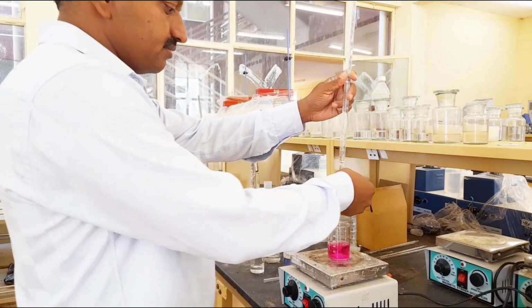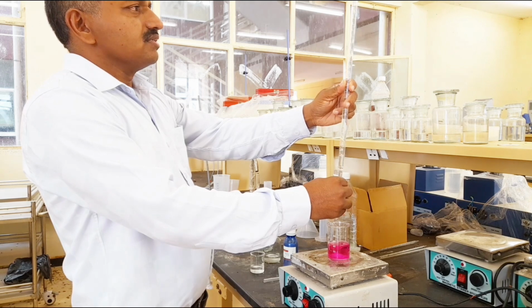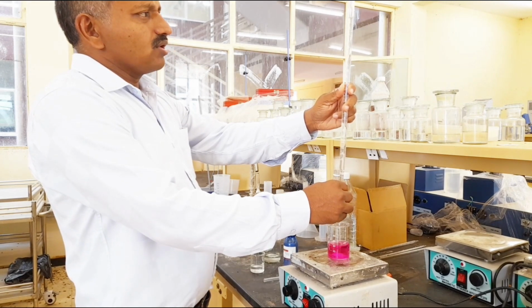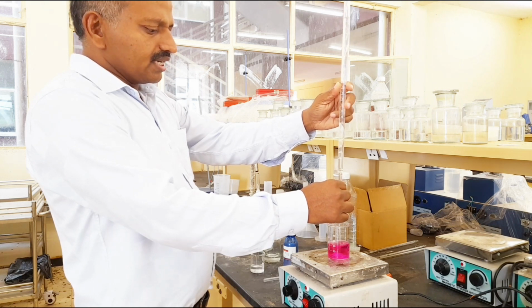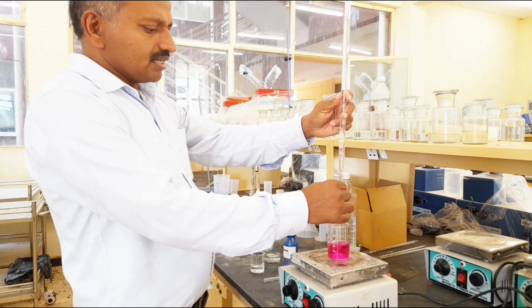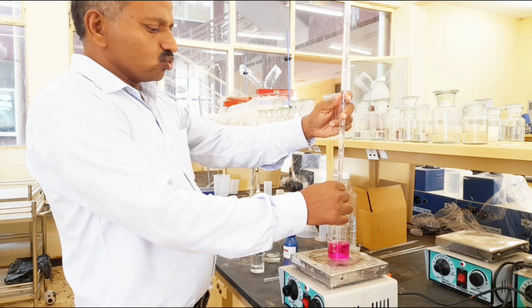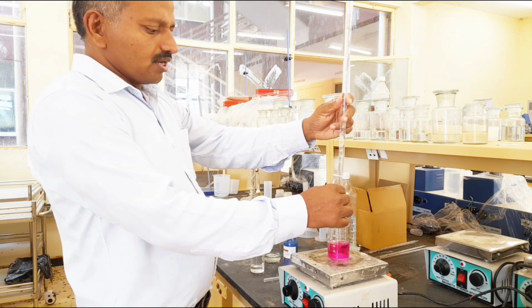Now I will start the reaction. Let us see how the color changes when the reaction ends. Slowly I am adding the hydrochloric acid from the burette. If you observe the reaction slowly, hydrochloric acid is coming drop by drop and reacting with the mixture solution containing phenolphthalein. Slowly the sodium hydroxide present inside the mixture converts into sodium chloride. When it is completely converted into sodium chloride, the mixture becomes neutral.